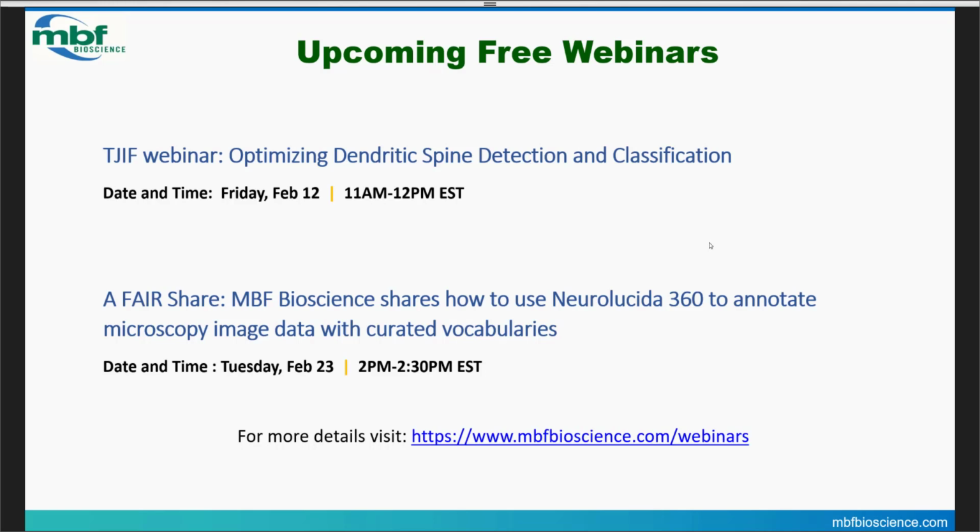A lot of questions about modality, whether it's Nissl, NeuN, DAPI, and I answered that partially in text, but do either of you want to talk to that? Originally, the modality that's used in the Allen coordinate space is the 2-photon image.